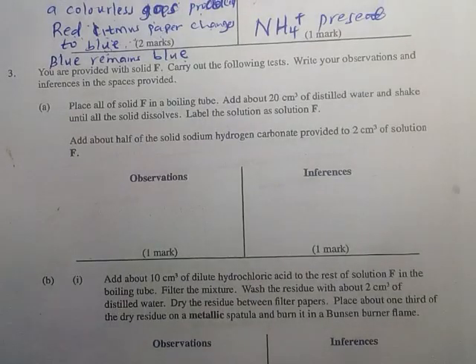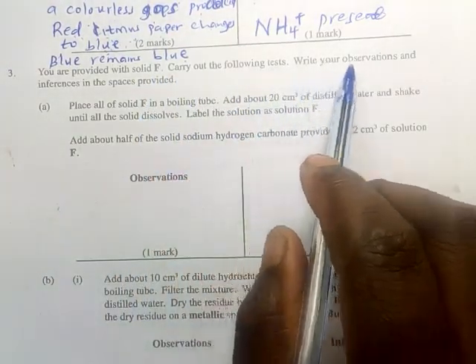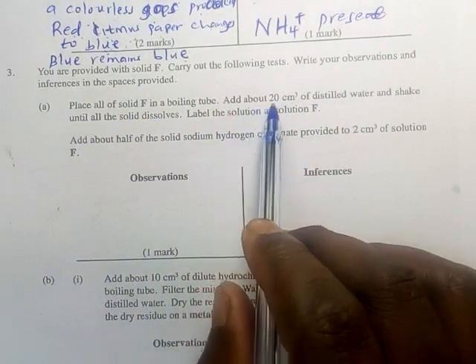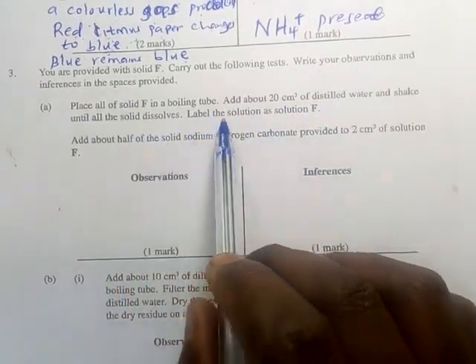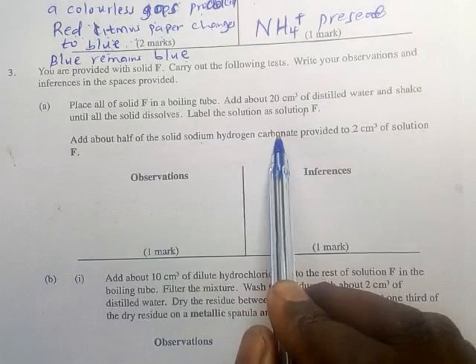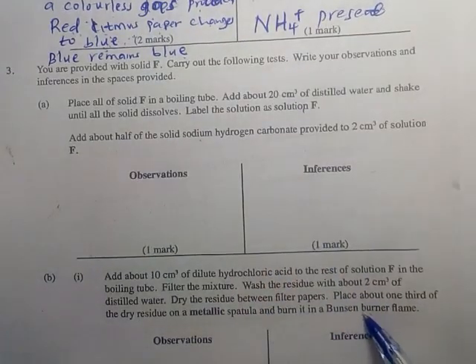We are provided with solid F. Carry out the following tests. Write your observations and inferences. Place all solid F in a boiling tube. Add 20 centimeters cube of distilled water and shake until the salt dissolves. Label the solution F. The first one, we are adding sodium hydrogen carbonate. Then we are burning this one in a Bunsen burner.